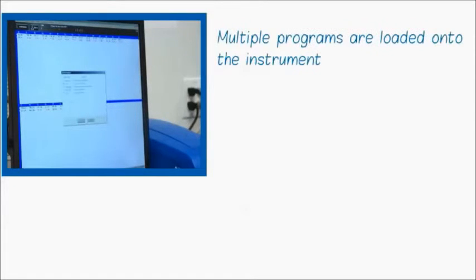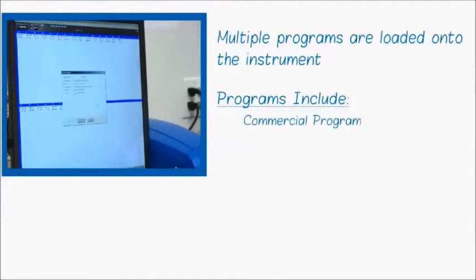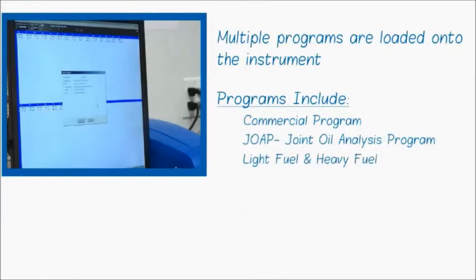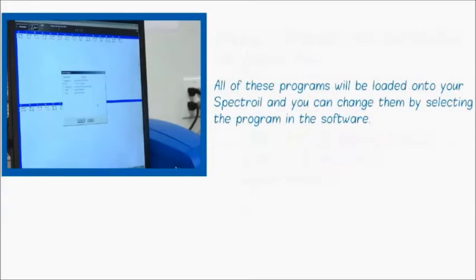If I go to File, Open, I can see all of the programs which are loaded onto my instrument. A program might be the commercial program, the JOAP program, for doing light fuel or heavy fuel, or for doing glycol and water. All of those programs will be loaded onto your Spectroil, and you can change them just by selecting the program in the software.